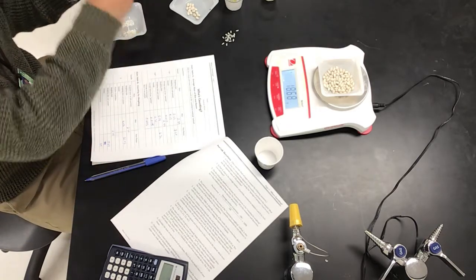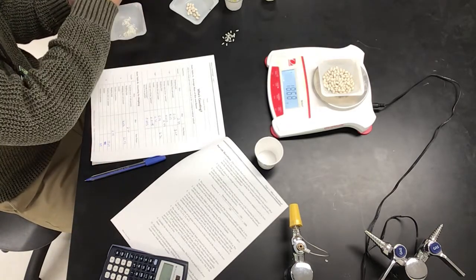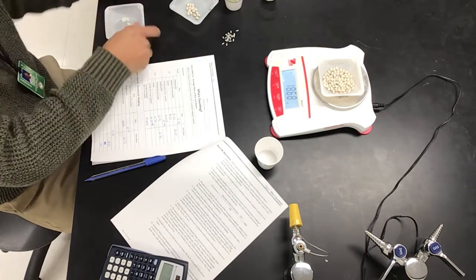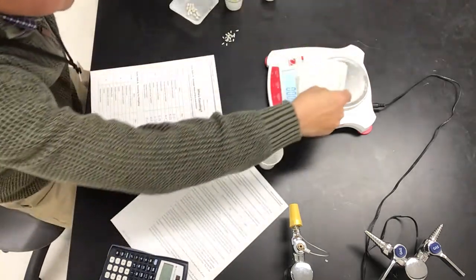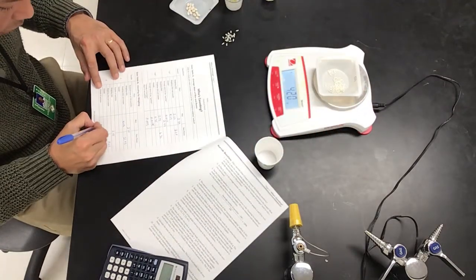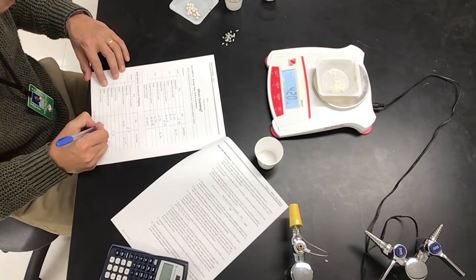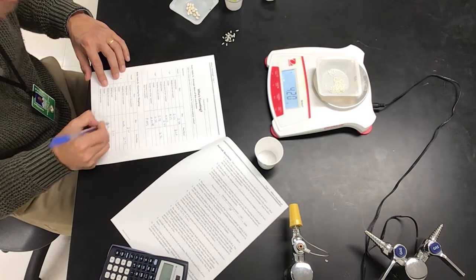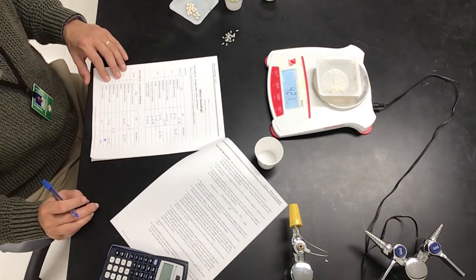I'm going to take out 10. For the rice, number of particles is 90. Sample weight, you can figure it out. Dish is the same. Dish and sample, 4.20. Fill in the rest, okay?